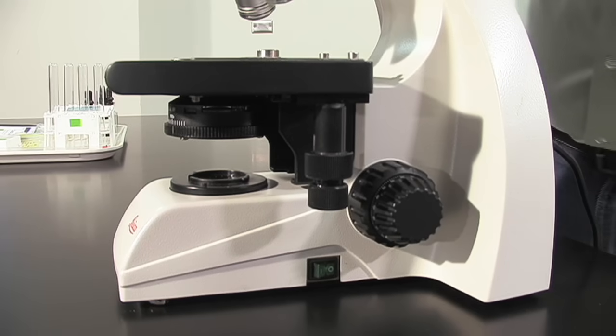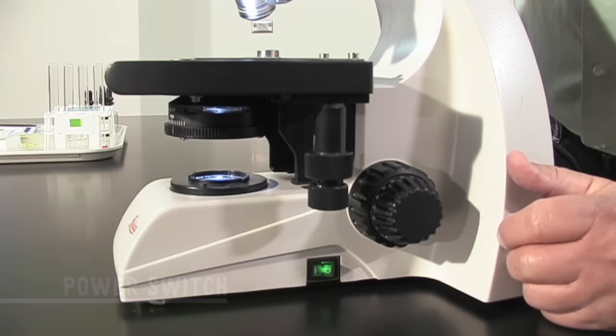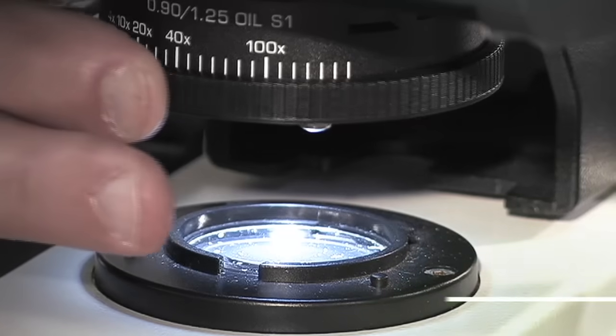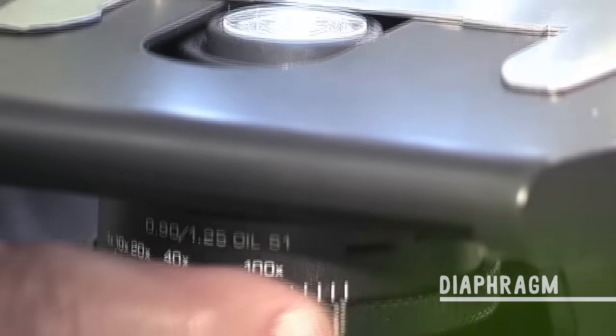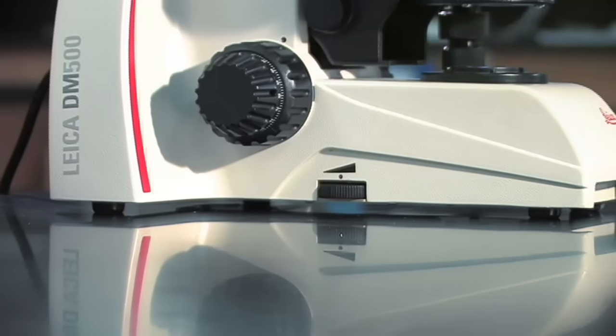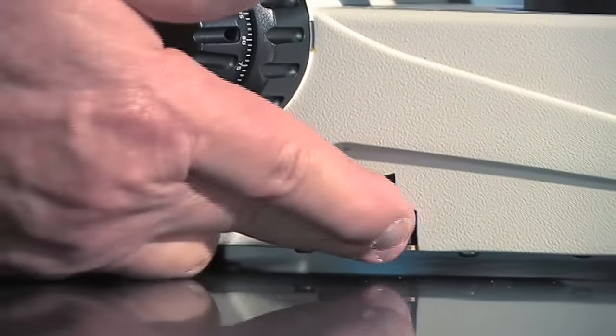There are three different adjustments for the light on this microscope. You have the power switch here, which turns the light on. We also have a ring mounted under here, which is called the diaphragm. By moving the ring of the diaphragm, I can control the amount of light that reaches the specimen — all the way from very bright to very dim. The third light adjustment on the microscope is right here — just a regular dimmer switch.